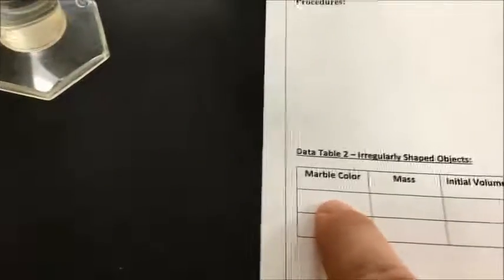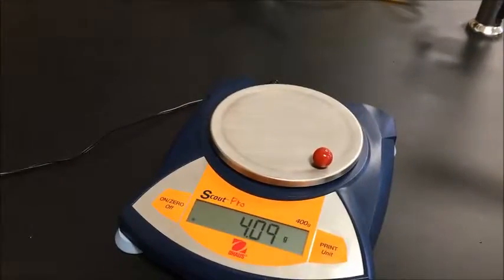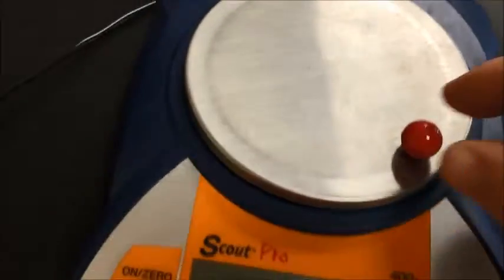So you got your marble, color red. Obviously you can find the mass of it very easily. You put it on the scale. It might roll around a little bit, but as long as it's on the scale, it'll stay. Not all marbles will weigh this much, so weigh your own. Then you figure out the volume by displacement.